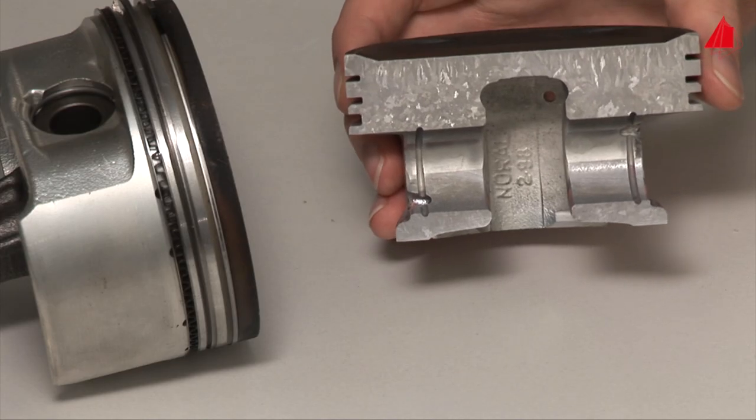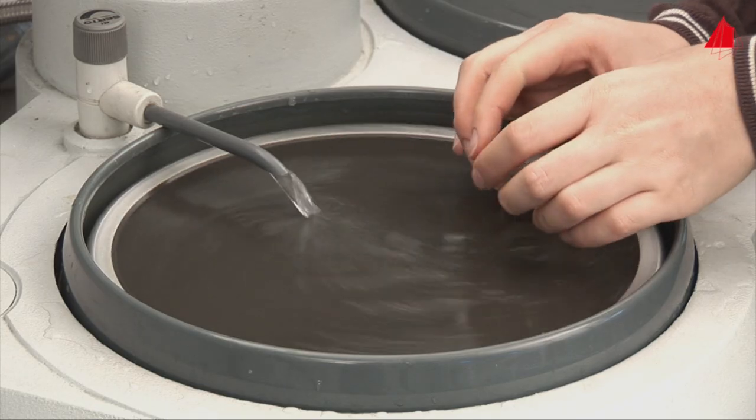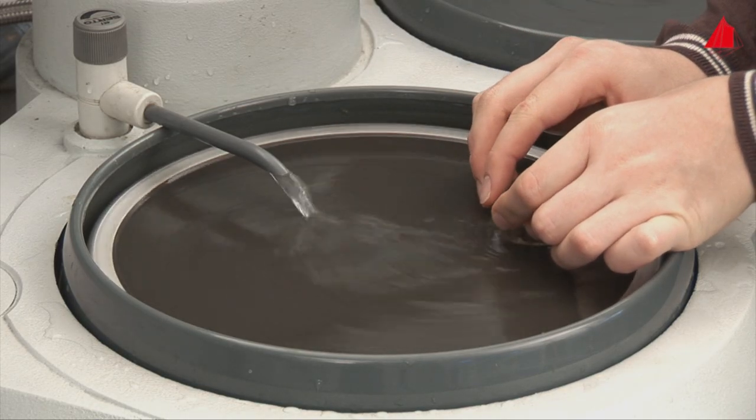Virtually all materials of our world can be examined metallographically. To show part of that variety, we will look at some additional test pieces made from different steels. All of these samples have been sectioned first. Some of them are so small that they have been mounted in resin for easier handling. And all of the samples have been wet ground with medium-grade abrasive paper. This was done towards the end of the preparation as shown here in the case of the tooth of a gear wheel. After grinding, not much is visible except from the typical grinding marks.